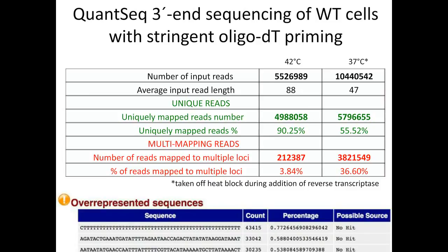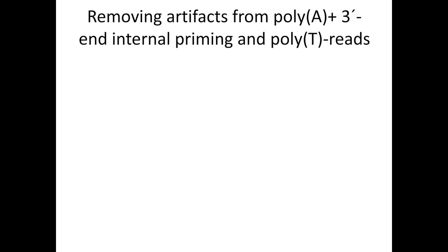And in this case, there was one sequence that popped out to us, which was a large stretch of T's. And so this particular artifact, we're not sure exactly the source of it, but it may be due to slight contamination with a read 1 primer that does not contain the poly-T N.